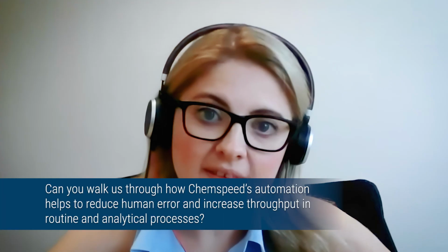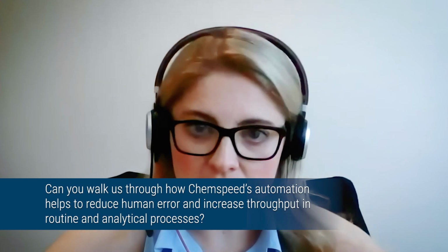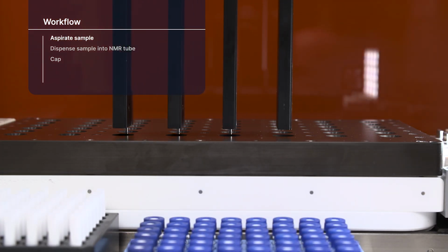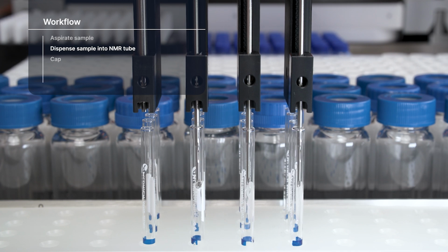There are many advantages automation can bring to routine analytical workflows, and we often start with our customers by asking them to describe their most time-consuming or resource-consuming tasks. And it's usually the ones which are extremely repetitive. They perform them every day. No one in the lab actually wants to do them. And I think a really good example of this is sample preparation for analytics. So regardless of the analytical technique, preparing samples takes a lot of time. It usually depends on the person who's performing this, the environment it's done in, the accuracies which are accepted by the workflow or by the person.